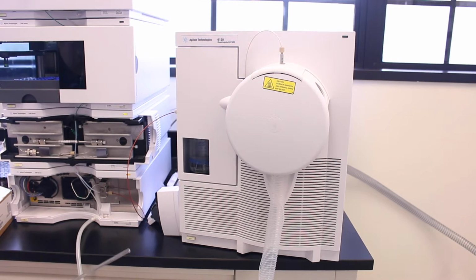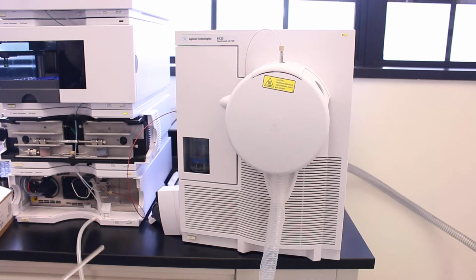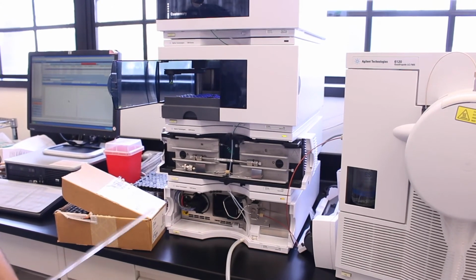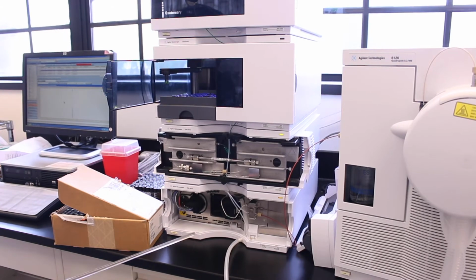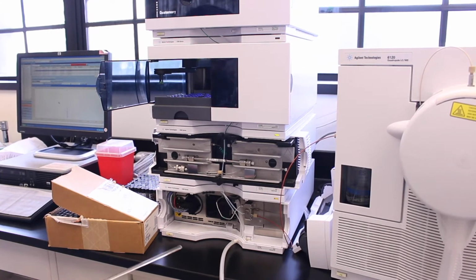You'll notice this is a larger mass spectrometer. It has a much larger footprint because it's an older instrument. So in gas chromatography, I didn't mention it, but gas was being used to push the mixture through a column. In that case, the gas was probably helium or hydrogen and sometimes nitrogen.